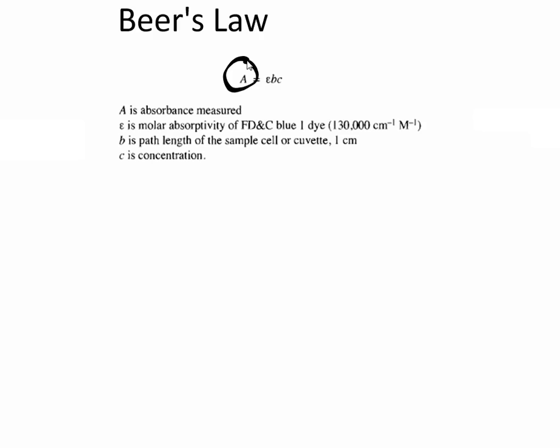So A is absorbance. Miss Matthews, Charlie Matthews, you're needed at the bus loop, please. Charlie Matthews.